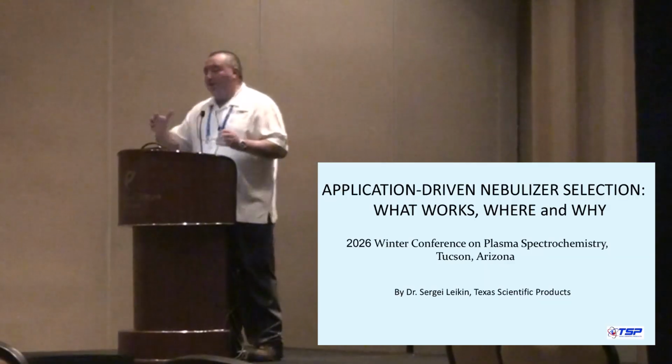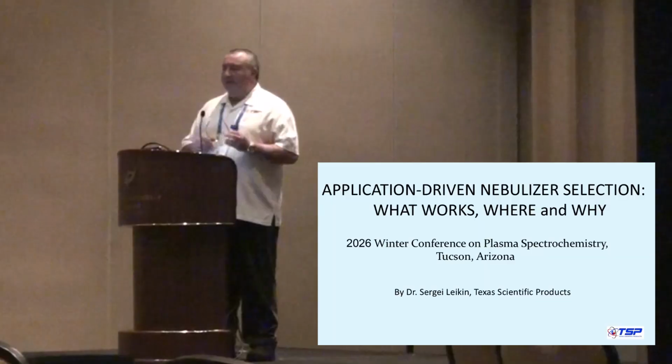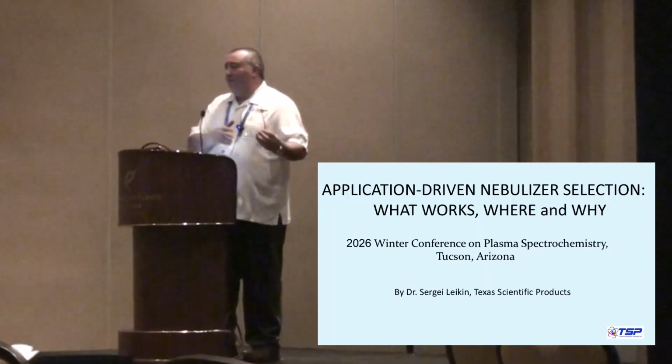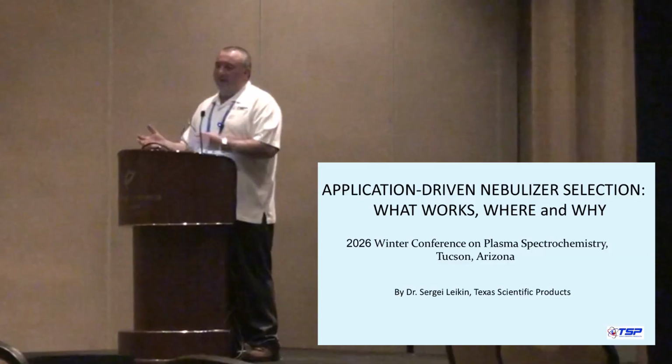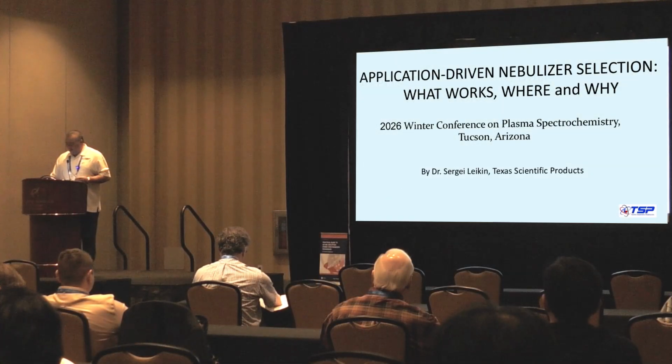So I'll try to cover briefly within 15 minutes what nebulizer to use for which application, right? Which is always a struggle for ICP users.